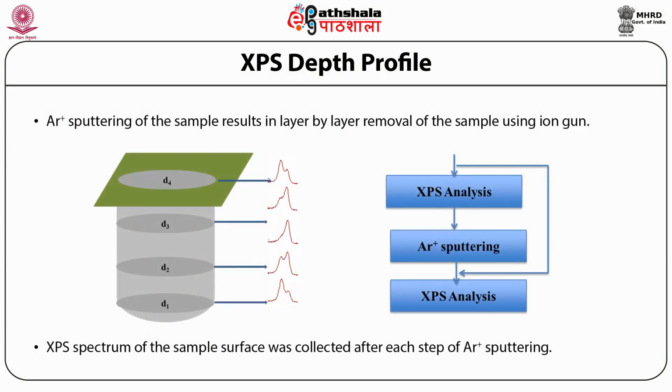The composition depth profile. The compositional change with position in the material can be understood by measuring the depth profile of XPS starting from the surface plane. The XPS is a surface sensitive technique.